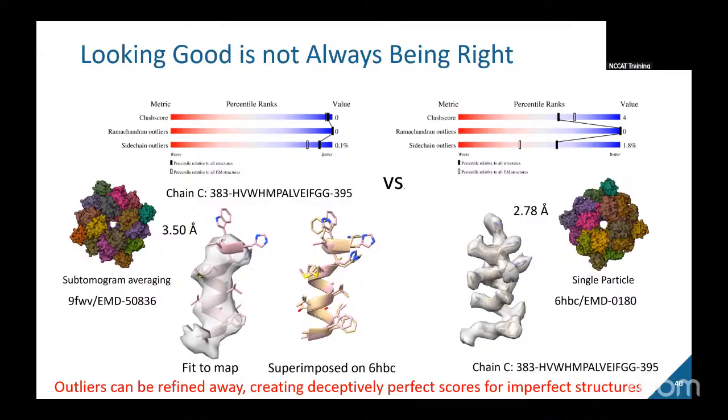Yeah, in the correspondence we were bringing up certain issues. So if we see density that just does not at all look like the resolution claim, or various other things, we do bring this kind of stuff up. We do not gatekeep at all. So we'll flag major issues, but ultimately it's a decision of the depositor.